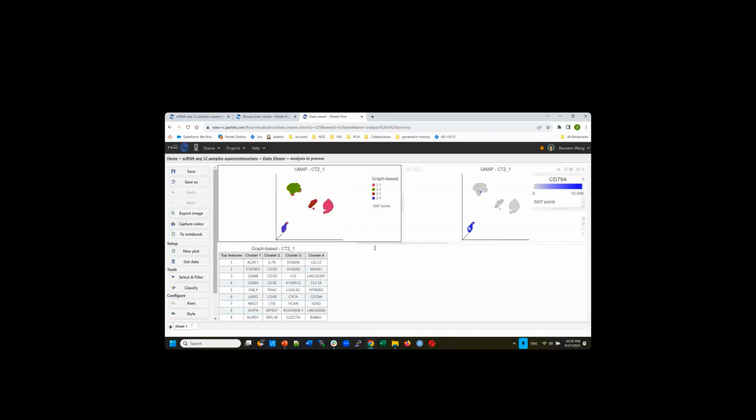Okay, so now you are still where you were when you go to the classify, and that's where you classified all the cells, and it's going to keep on going. After you finish all your samples, do not click apply classification if you didn't finish the first iteration. You can always save the session. But once you finish everything that you can identify, you probably still have some cells you won't be able to classify, but that's fine. This is my first iteration.